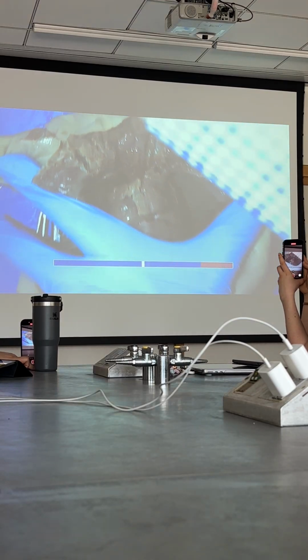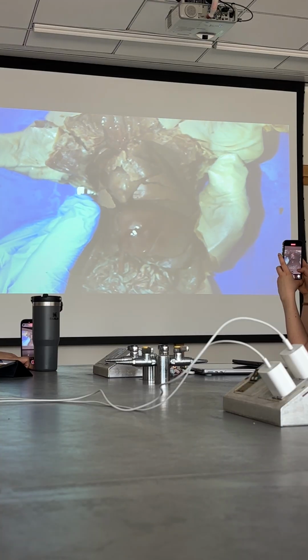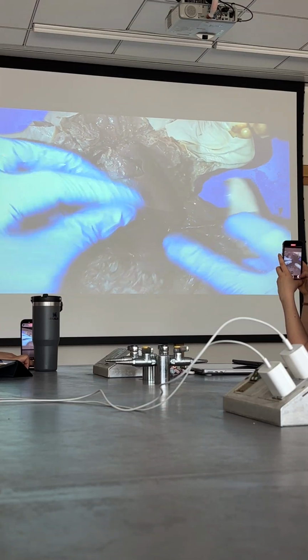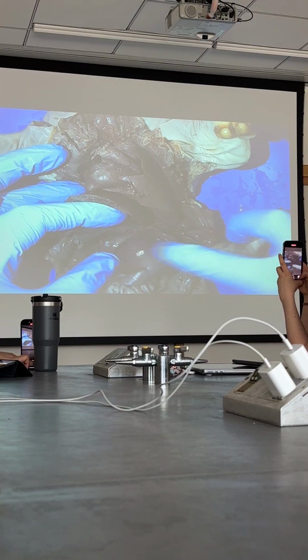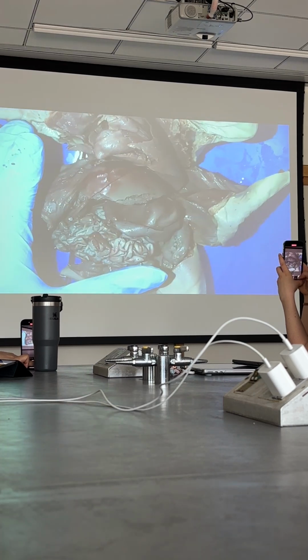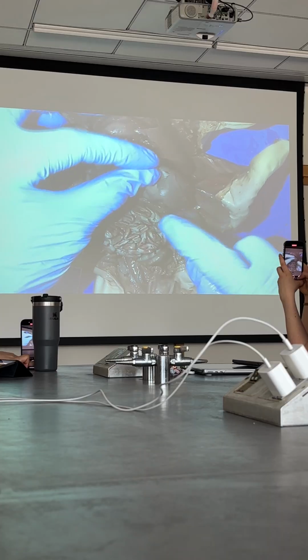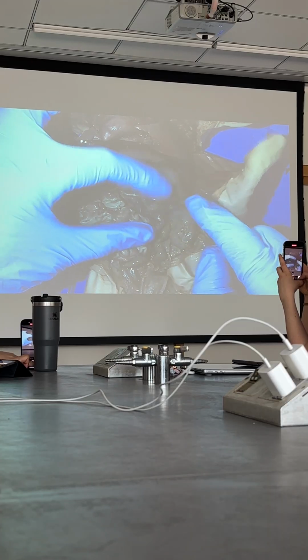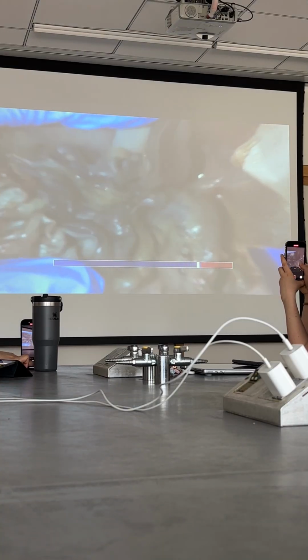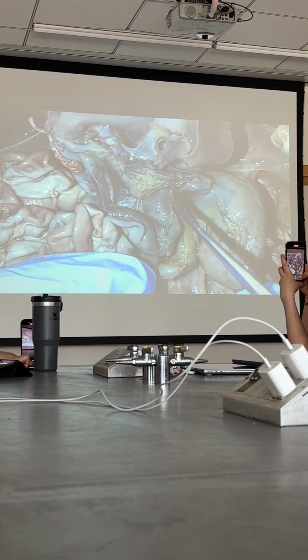If we continue our way down, not much to see in the thoracic cavity, at least for these labs. So you get into the abdominal cavity, and this big guy here, of course, is going to be the stomach, which is pretty easy to see. If you retract the stomach superiorly along with the spleen, and you look behind it, that's where you should find the pancreas. And so this is the pancreas here.